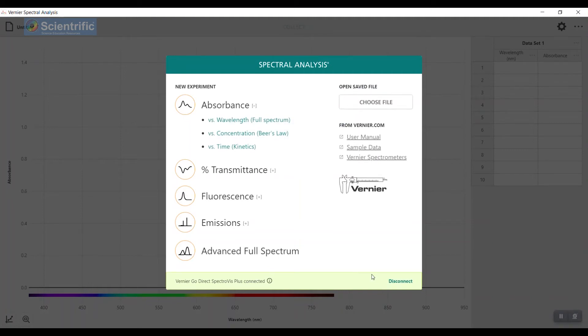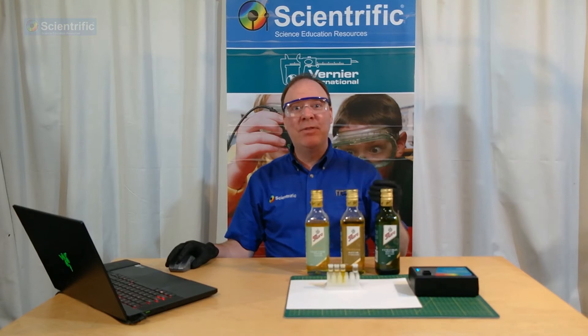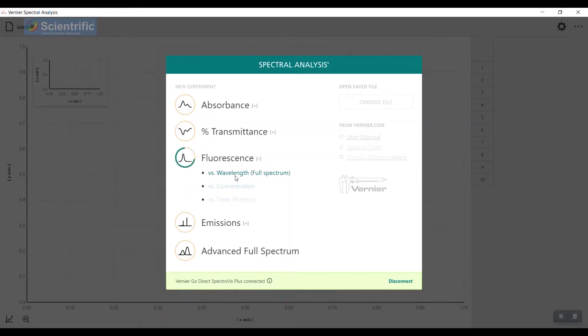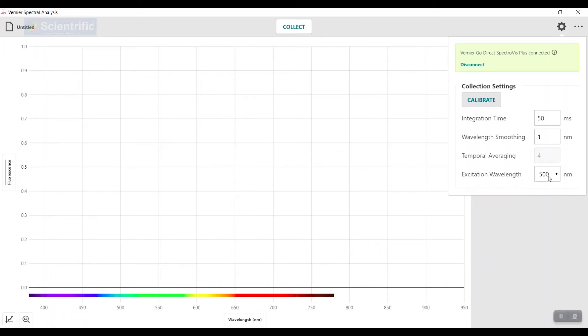Instead of looking at the absorbance peaks, I'm going to jump straight to fluorescence. We're going to send a UV wavelength through our cuvette to look at the peaks we get back, because chlorophyll does fluoresce. I'll go to wavelength full spectrum. The excitation wavelength for chlorophyll is actually 405, so I'll change it there, and we'll look at our integration time as we go along.